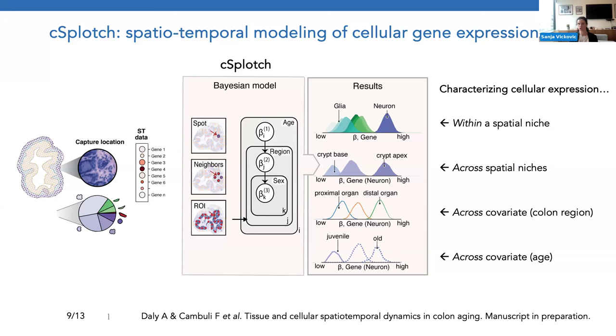And then I'm, of course, doing these type of Monte Carlo samplings for each single gene and each single spot in our model. What happens is that the results, what the model gives you, are posterior estimates of that gene expression rates that you see on the right. On the x-axis, you see the betas, so the characteristic gene expression rates for different genes. But what happens when you have Bayesian posterior estimates, it enables you to do hypothesis testing.